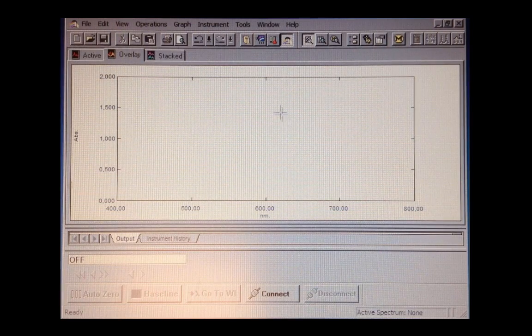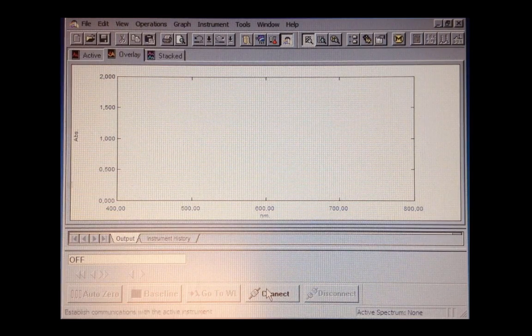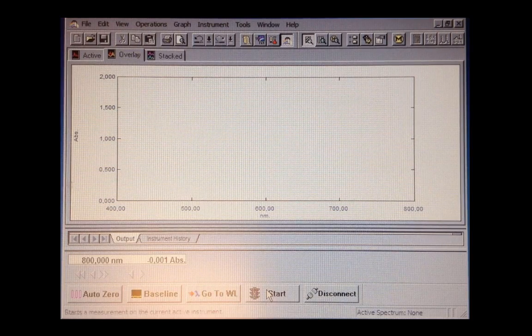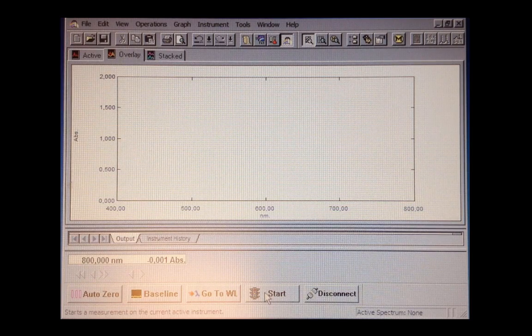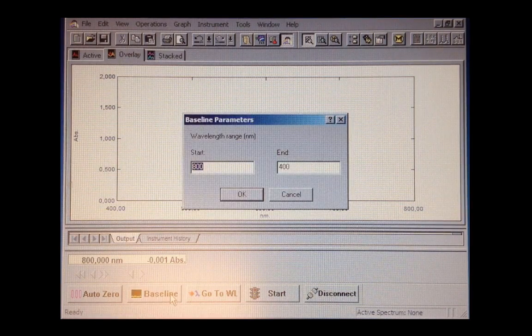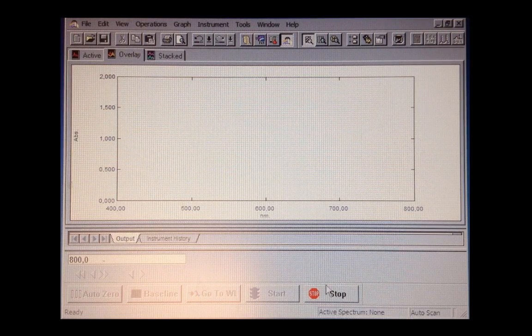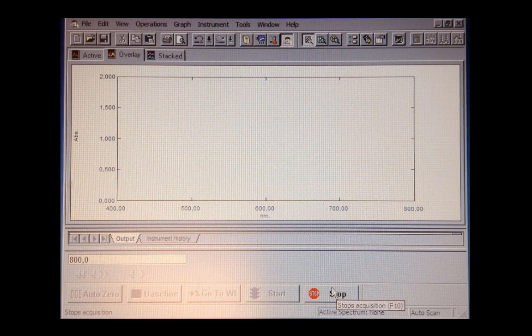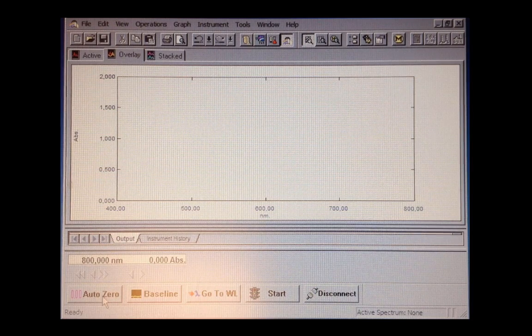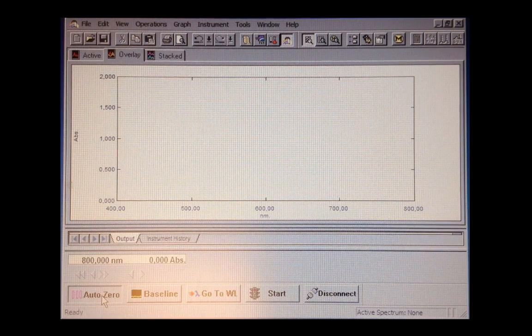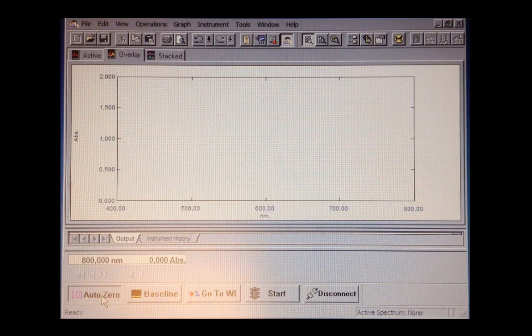But before you do an experiment, remember to connect the computer and the UV-Vis spectrometer by clicking. After that, you need to do a baseline scan to see if everything is OK or there was some error. You just wait until it stops. After that, click AutoZero. If there was some error, AutoZero will eliminate the error, so your experiment will be OK.